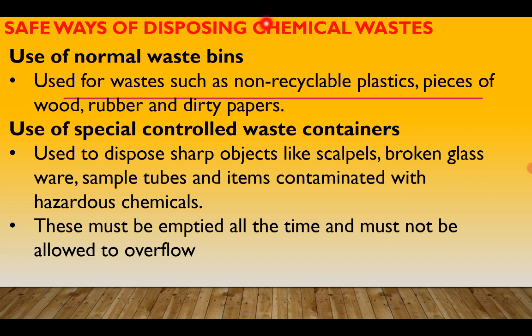So we need to devise ways and means of getting rid of chemical waste as it is being generated. All right, so we are going to look at a number of ways of disposing of chemical waste in the lab.